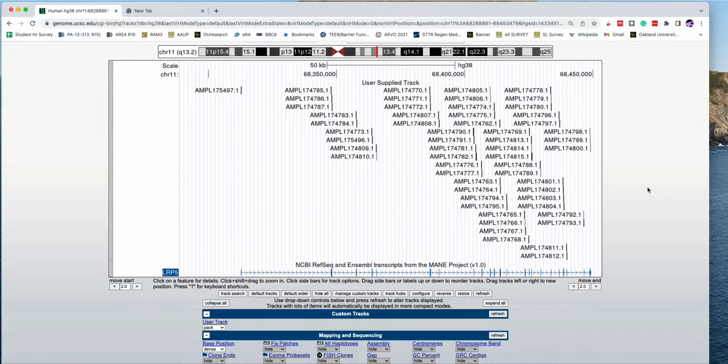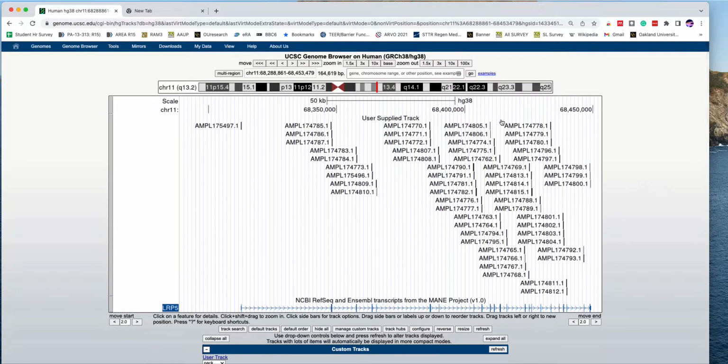So now we have your gene. People see where all the amplicons are that we're sequencing. This is the diagram section. Above it, this image that we have of the whole chromosome with the little red mark showing us where we're kind of positioned on that chromosome, that horizontal structure diagram is the chromosome ideogram. What I need you to provide is this chromosome ideogram and then this diagram of tracks as PDF files.